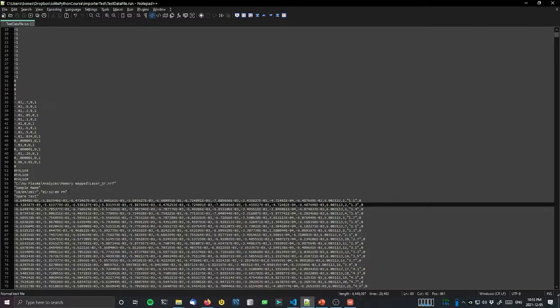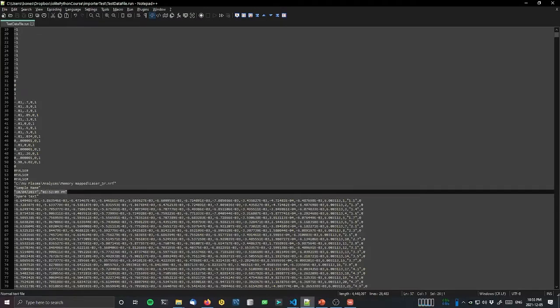The other thing I'll be looking at straight away is whether or not it has a decent timestamp. If it doesn't have a decent timestamp, and by decent I mean in a reasonably easily readable format and with a reasonable amount of precision, and by reasonable I mean it should at least have seconds. If it doesn't have seconds, you might still be okay, but it means that your file could be offset by up to 60 seconds. If your files are quite long and you don't have many in your session, then that might not be too much of a problem.